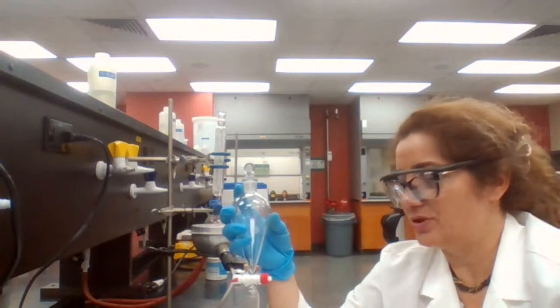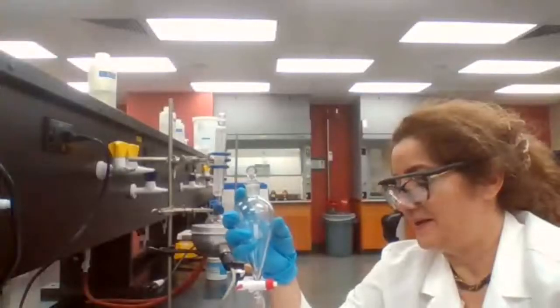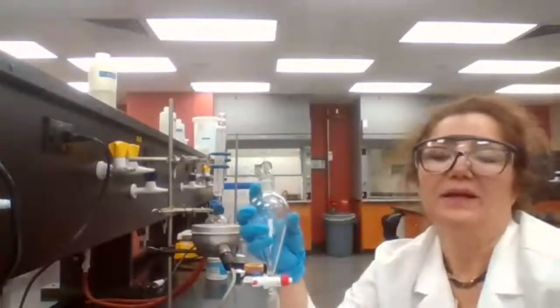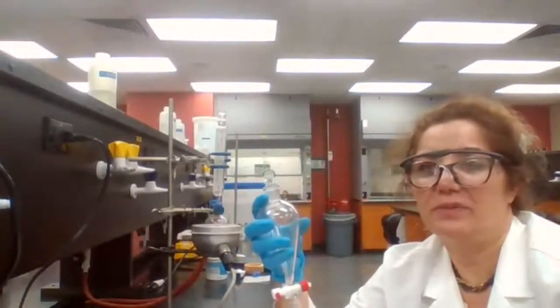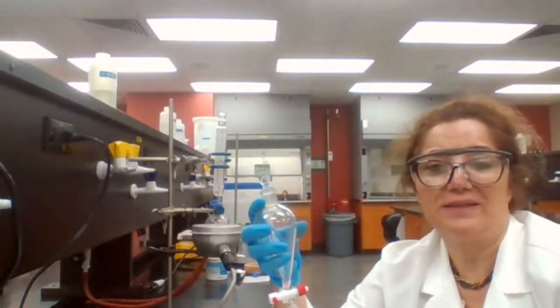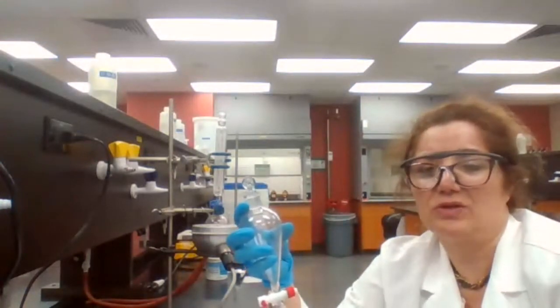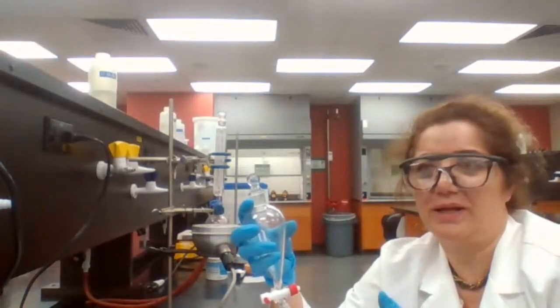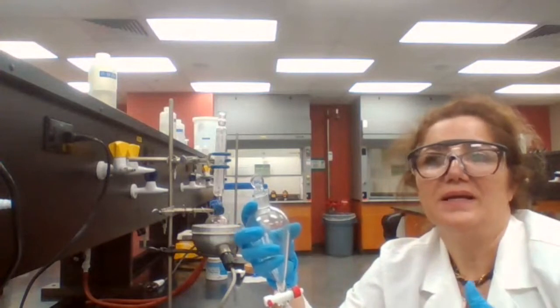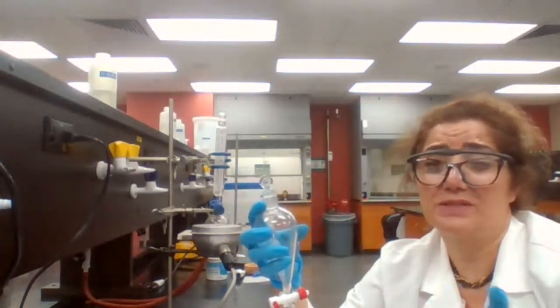That is the answer to your question. That's what we use the sodium bicarbonate for. Very good, yes. When you use the sodium bicarbonate, you wash the organic layer with sodium bicarbonate. It's going to react with benzoic acid, and the benzoic acid is going to change to sodium benzoate. So it's an acid-base reaction. Sodium bicarbonate with benzoic acid is going to give you an acid-base reaction. The product is going to be salt and water.